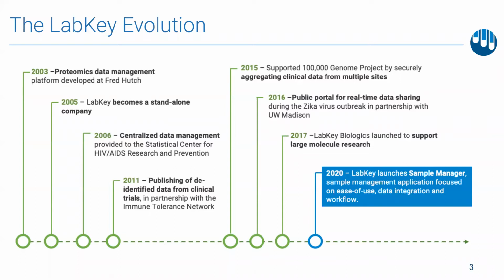In 2015, we were contracted to expand functionality for the 100,000 Genomes Project to aggregate and secure clinical data gathered from multiple sites across the UK. In partnership with the O'Connor Lab at the University of Wisconsin, we began hosting a public portal for real-time data sharing during the Zika virus outbreak to improve data accessibility.